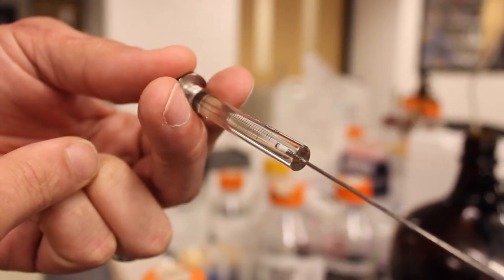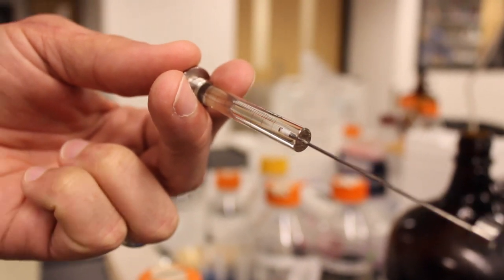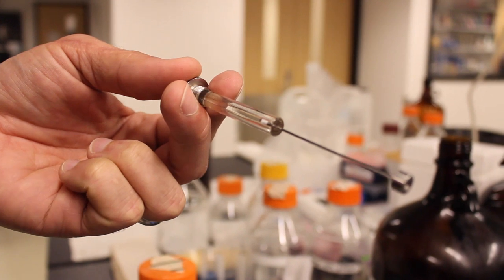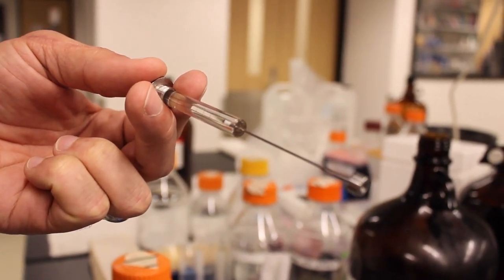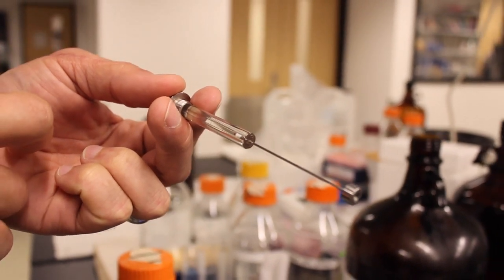This gap acts as a sort of shock absorber so that the solution is ejected smoothly as it steps from one titration step to the next. It's important to have that gap in there you don't want the plunger touching the top of the syringe.